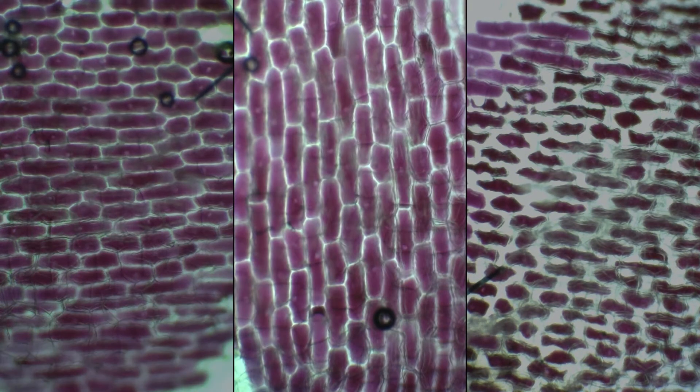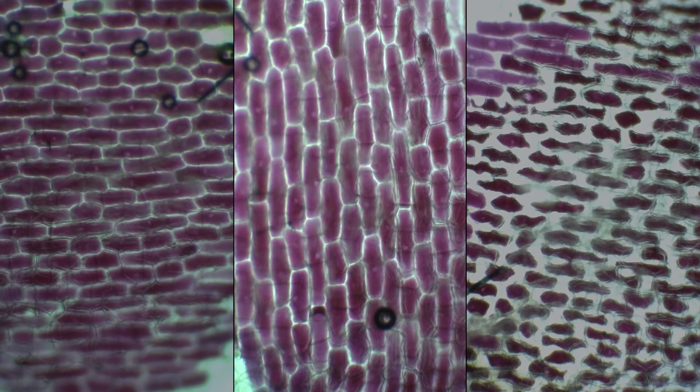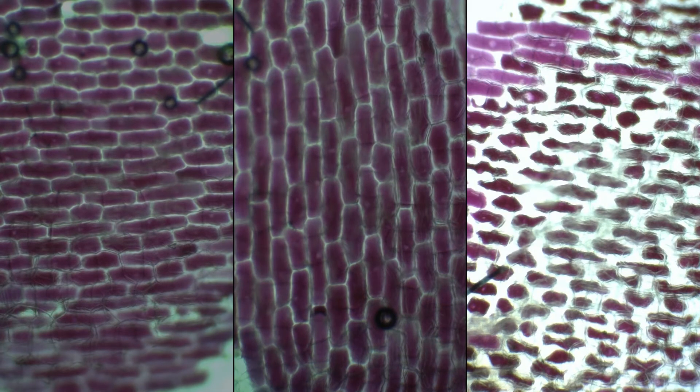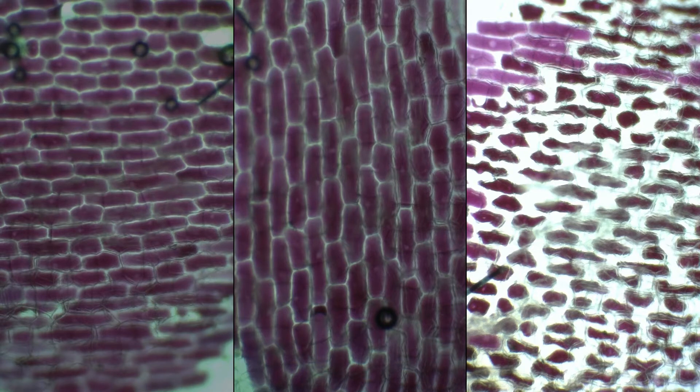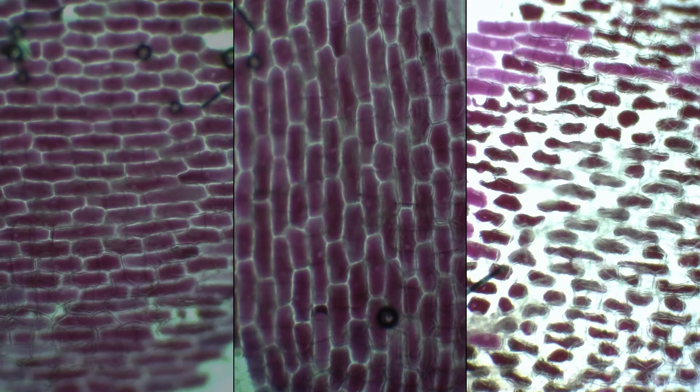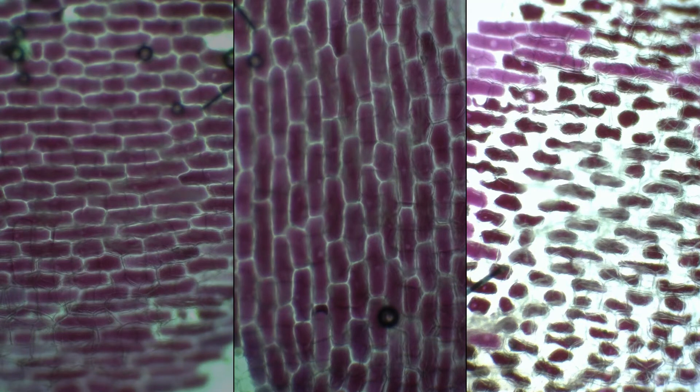The ones in the middle are our flaccid cells — there hasn't been much change. Water hasn't left or entered, or the net change is zero, so those cells are as they were at the beginning. The ones on the right hand side have been what we call plasmolyzed — those were our cells in salt solution. Those cells have lost their water; the water potential inside the cell was higher than outside. The water has all gone out and the cell has started to shrivel up. Because plant cells have a cell wall into which the cell membrane is anchored, you get that pinching away — you can see it on the micrograph on the right, with the vacuole pulling away from the cell wall and losing volume. You can also see that the red coloration has got darker, because it's more concentrated — the water has left, leaving a more concentrated solution of that pigment behind.